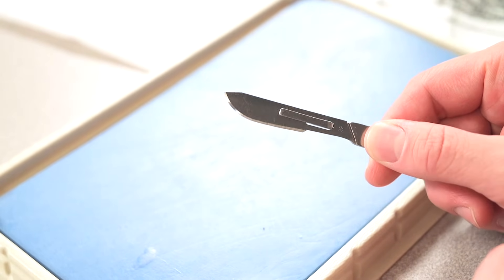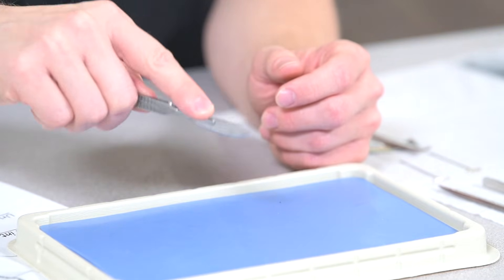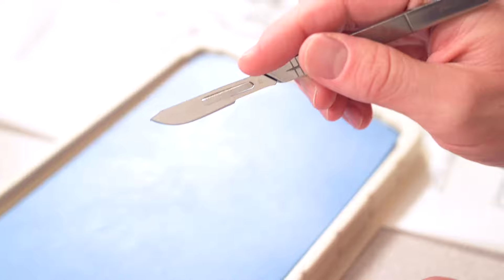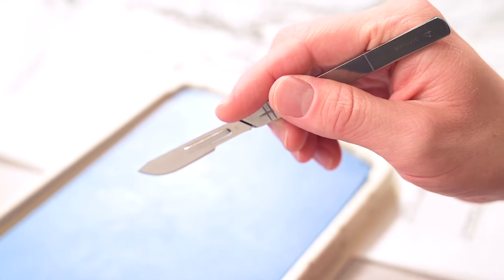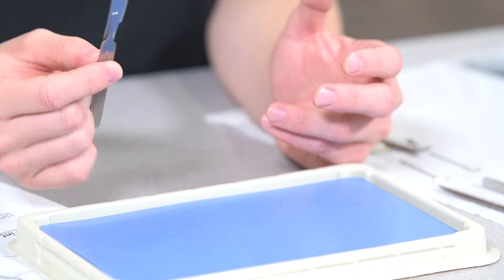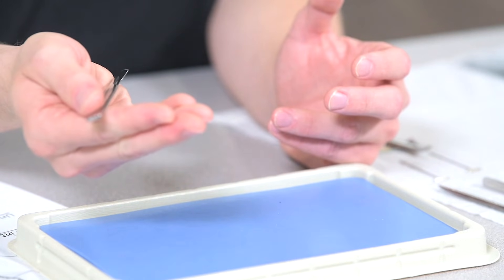To hold a scalpel using a number 22 blade, you want to use an overhand grip, giving you more support to cut through tougher tissue like fascia. If you're trying to do a more precise incision, like with a number 10 blade, you would use a pencil grip, using the scalpel as an extension of your finger. Whenever you are passing this tool, hold the flat edge of the blade to your hand with the handle extended out.